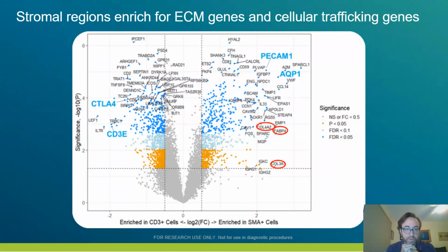All of this data is really interesting in that you can start to peer through this and identify novel genes that you may not have identified before from bulk or single cell profiling. But it also allows us to take a next step further into understanding what this tissue functionally does. One of the common ways in which data from either bulk or single cell profiling has been analyzed is to contextualize gene sets by comparing them to previously annotated gene set ontologies. And so we've performed a similar analysis here.